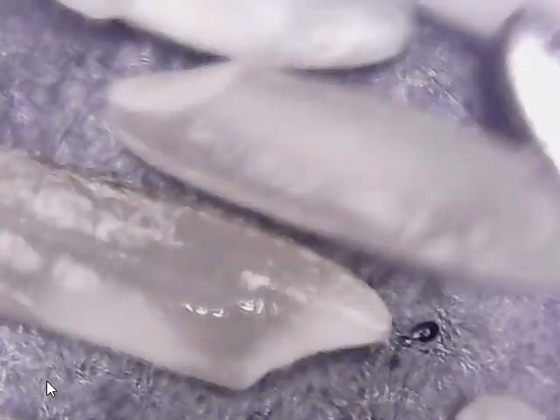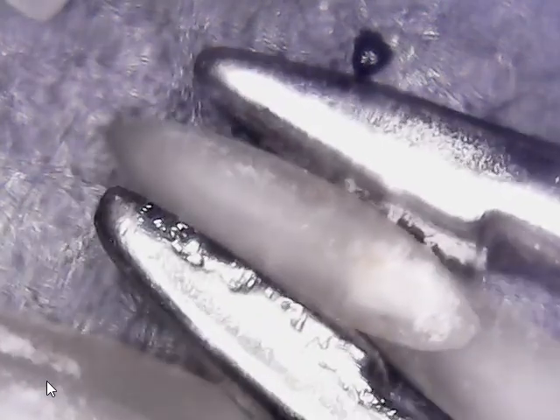They're not at all uniform. Look at the shapes, they all look the same normally, but okay, let's look at this one specifically. It's basically very smooth, you know, it's a rounded and round-ended cylinder basically.